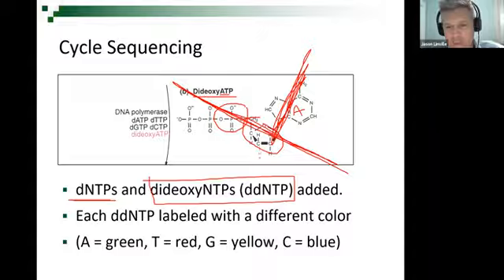And when we're adding normal dNTPs, we just stack these half rungs right next to each other when we're making the DNA. An A, and then a G, and then a C. I can barely even draw a C. Now, this is where dideoxy nucleotides are different.